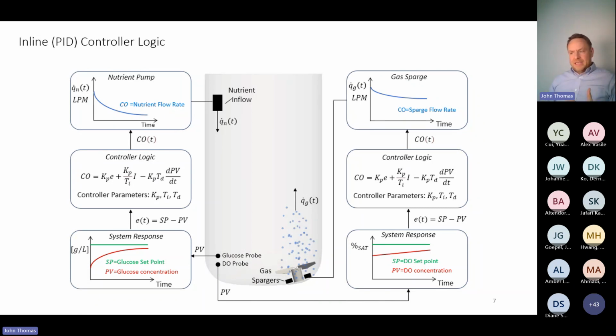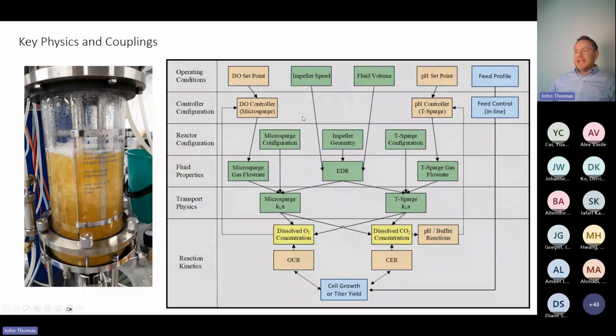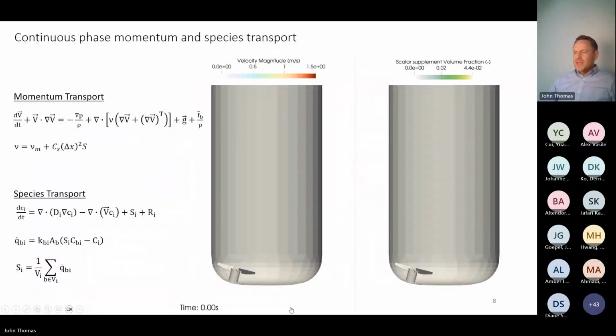Again, I want to reemphasize here that we are going to be incorporating these controller logics into the CFD simulation as well as the biokinetics, as we're going to get this whole coupled picture. I don't mean to go back in time, but I'm marching through this daisy chain, as it were, to develop this coupled simulation that allows me to set the operating conditions, understand the engagement with the controller and the reactor topology to inform cell growth. So that's really what's driving all this.